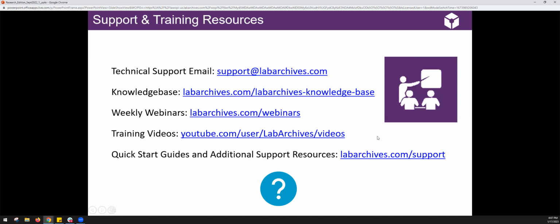Let's talk about support. So you're very fortunate to have an excellent team on campus. Michele and Sarah are here from that team, and there are a few others as well. I believe they have some contact information and a website. They may send that in a minute. But you also have our support team. Our support team is available 8 a.m. to 8 p.m. Monday through Friday. Call, live chat, email. Please do get in contact with us if you've got questions, feedback, suggestions, want to dig in a little bit more. And we also have a knowledge base on everything LabArchives.